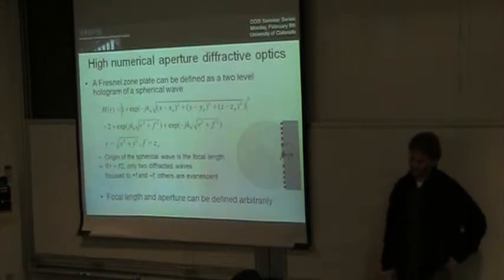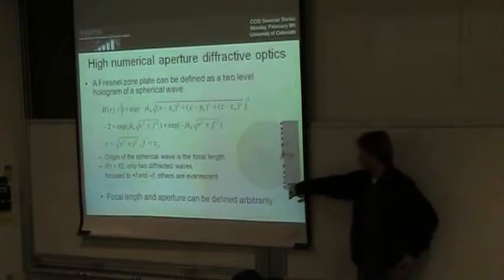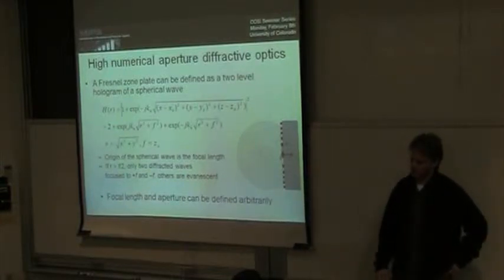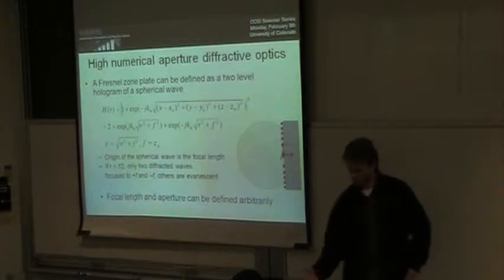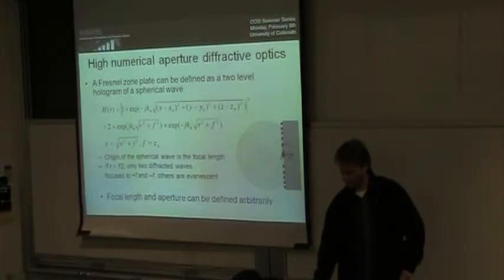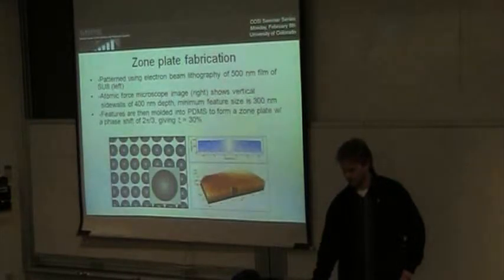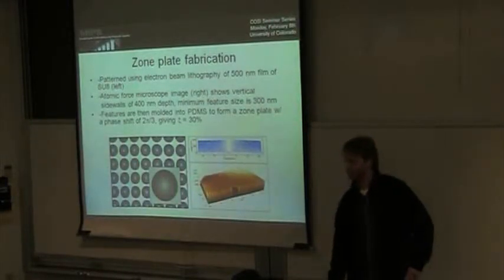So the diffractive lens doesn't have perfect diffraction efficiency. If it has a pi phase shift, it's 40%, but there's no other orders to worry about, which would happen for a lower numerical aperture diffractive lens. Please ask any questions.